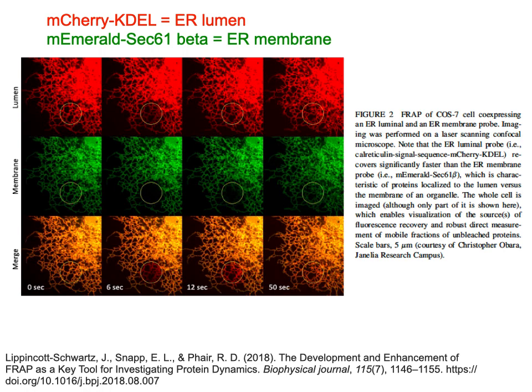The other reason I picked this paper is because it is looking at the use of FRAP for membranes that are not the plasma membrane. Traditionally FRAP is looked at on proteins in the plasma membrane, but it can also be used in other membranes like the ER. And they also look at the nucleus, so nuclear membranes, or the nuclear envelope.